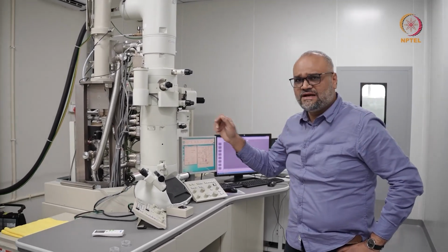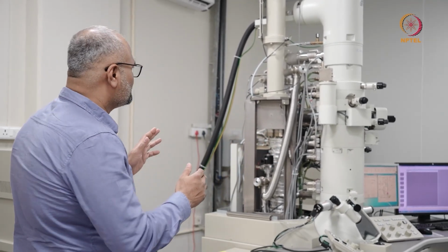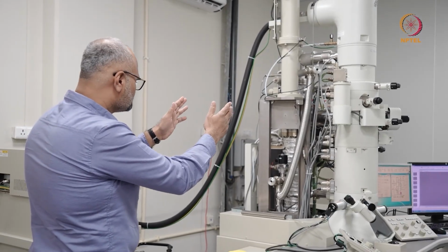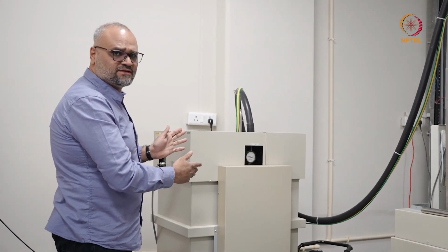Now if I move behind the instrument, we'll look at the general layout of how a transmission electron microscope is laid out in laboratories in general. What you have is the main instrument column here. You have the high tension tank behind the microscope here.